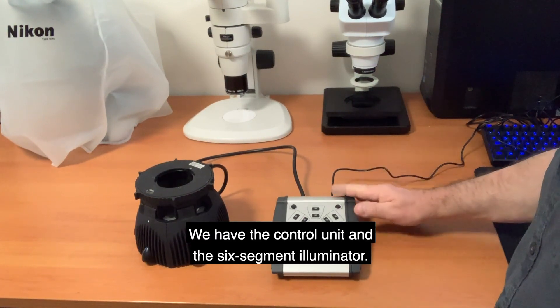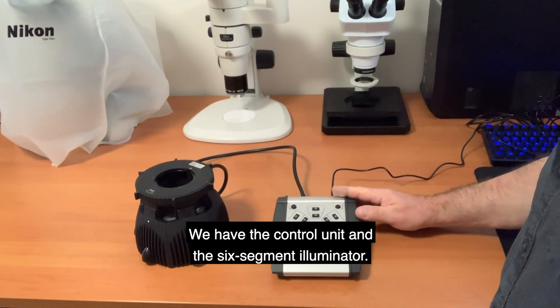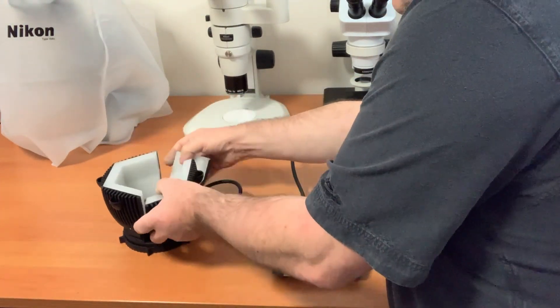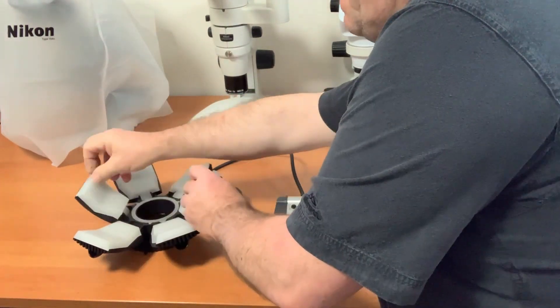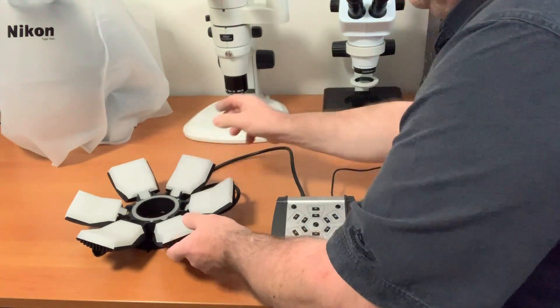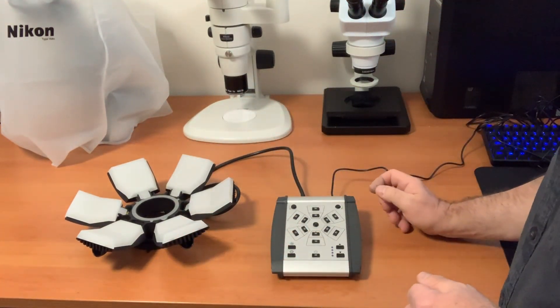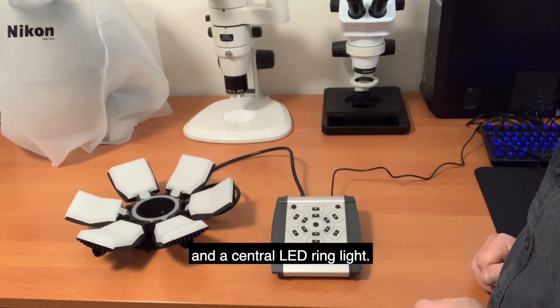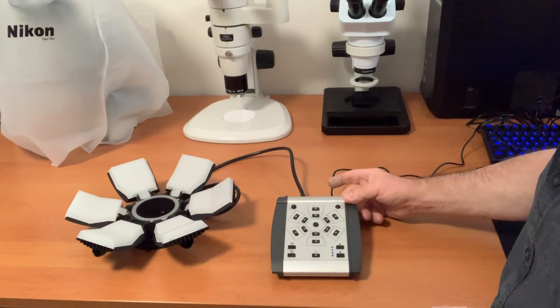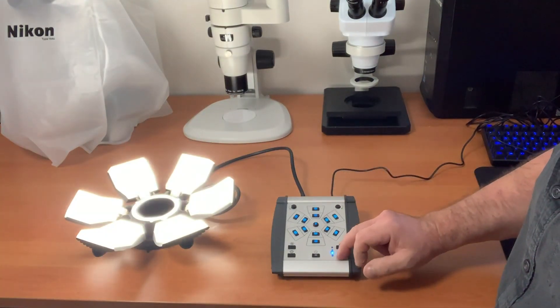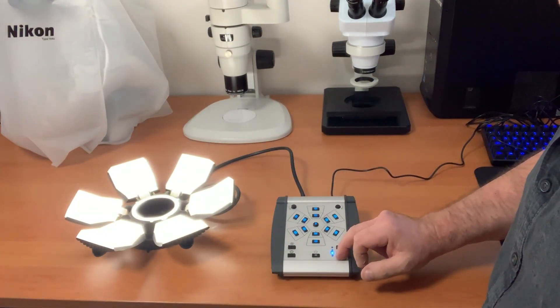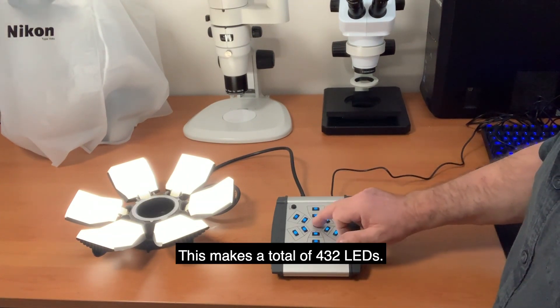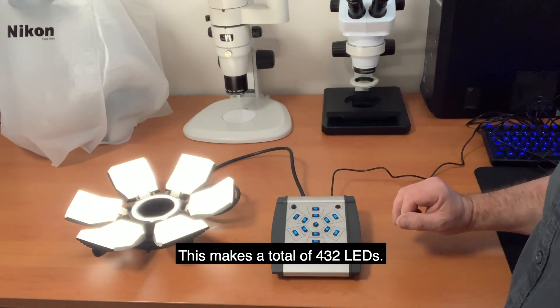We have the control unit and the six segment illuminator. There are six tilting arms, each with 68 LEDs and a central LED ring light. This makes a total of 432 LEDs.